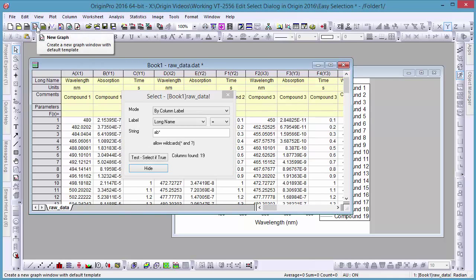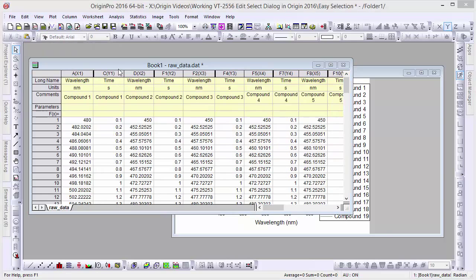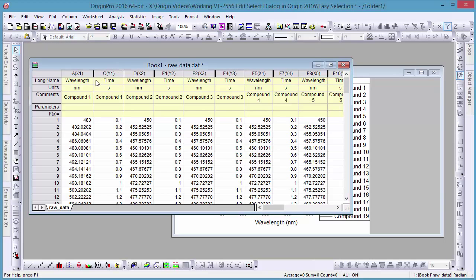To unhide a column, individually double-click on the thicker borders between those columns to either side of one hidden.